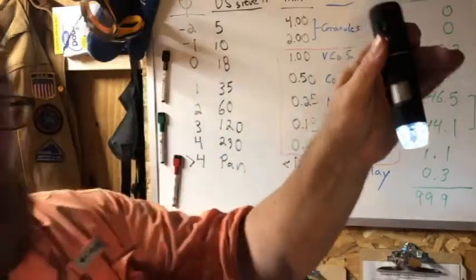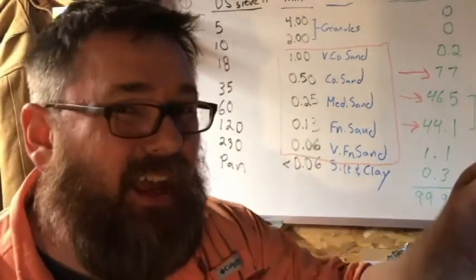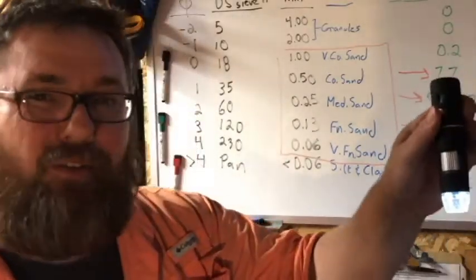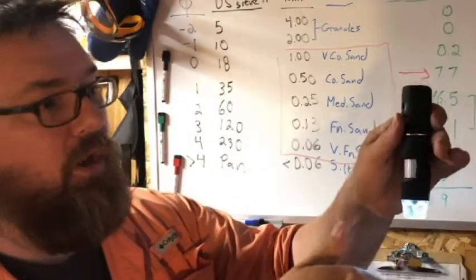It comes with this little plastic cover. You have to take it off to use it. There's your microscope and it shines lights on. Turn this on first. You hold that down, you get the light. You turn the app on, go into your phone, activate the wireless. It doesn't have to have an actual wireless connection. Then you go to the app and you can see what you're looking at.